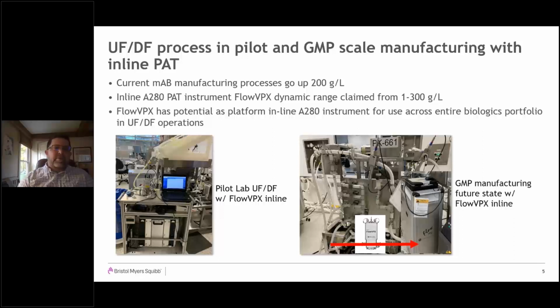It can be used at bench scale, and it can be used at pilot scale, and that is what's shown in this lower left picture. You can see it sitting on a cart with a computer, connected to those hoses. That's actually the bulk retentate bag. And what we have here on the right is another kind of cartoon, sort of.